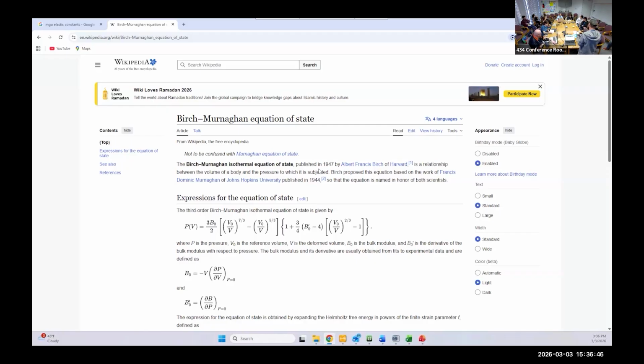For the software that you're using, are you primarily using it as you're collecting the data, or to simulate possible scenarios of the experiment you are doing to get probable outputs? I'm not sure if I fully know what you mean, but usually we're doing it with reference to the peaks that we have in our experiment. Okay. So collect the data. Yeah, we're not trying to go up to this place. Well, maybe we are. If you wanted to run your experiment at 5 GPa, then you'd wait until the peak reaches 5 GPa.